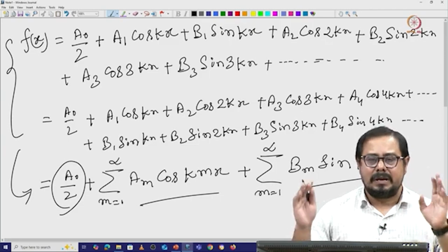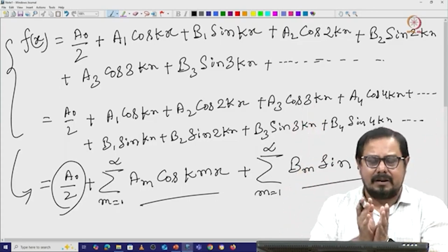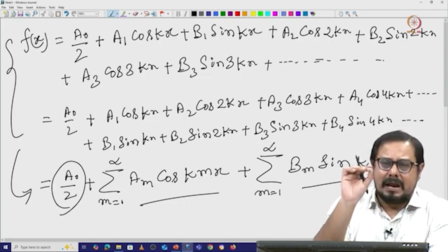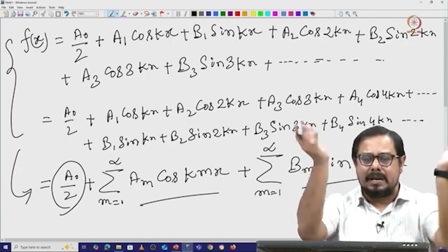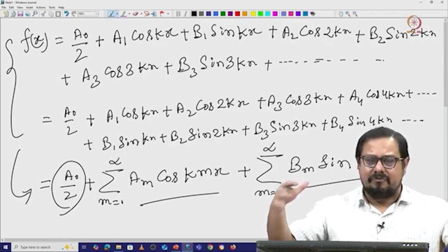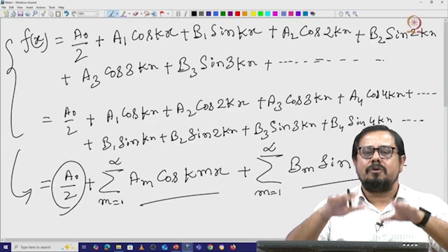So, why is it required? If you remember, when I was drawing the ray diagram for TEM images, there are multiple waves coming and converging in one particular point, and that is giving you the first diffraction spot. If you try to analyze that diffraction spot, it is not a single wave, it is multiple waves coming and converging in one particular point, and there it will be a different type of wave function, all merged together and giving that spot. And further, if you go from that one, you will get that image.